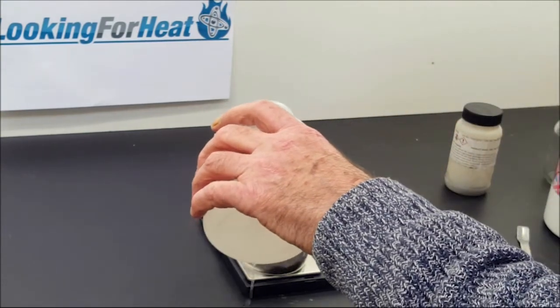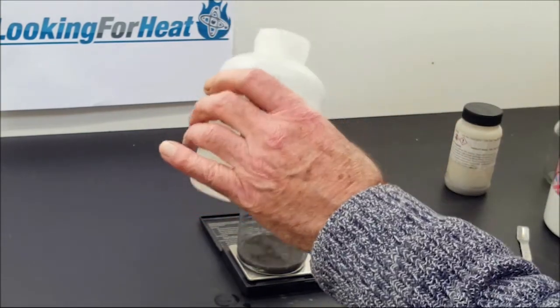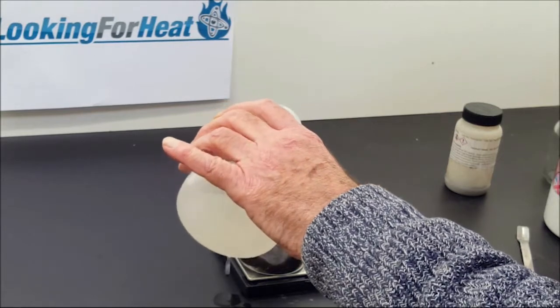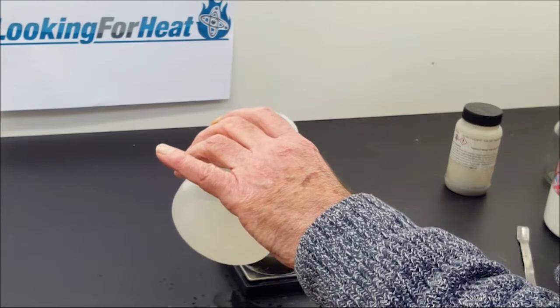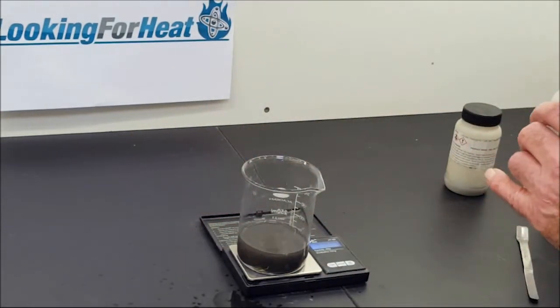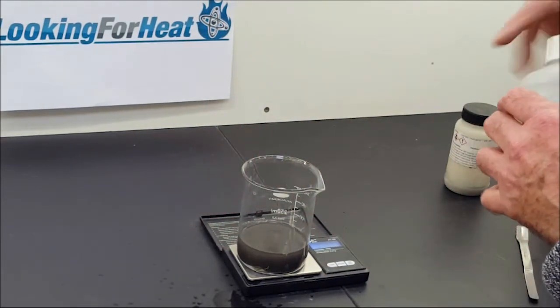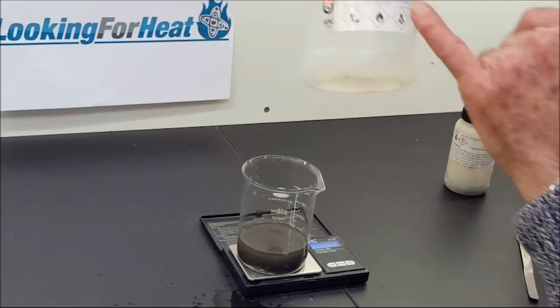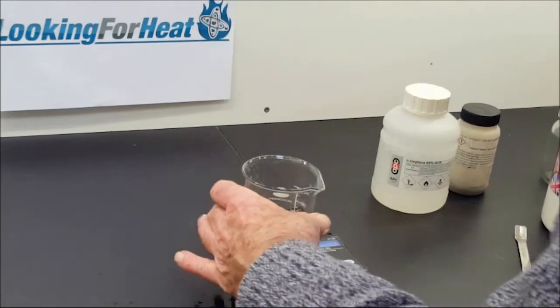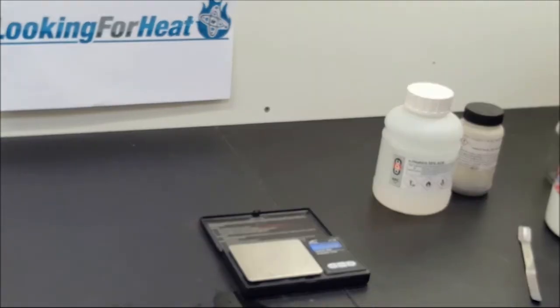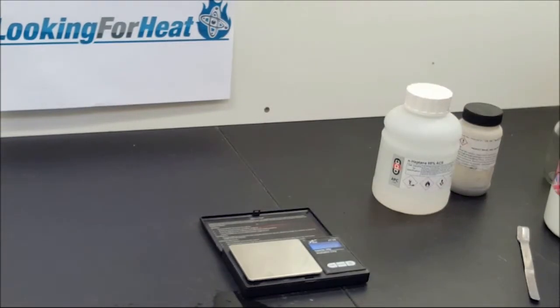Now I'm going to add 50 grams of heptane. This is 95% pure heptane. The impurities are generally speaking other alkanes. Now I'm going to put this in the sonication system.